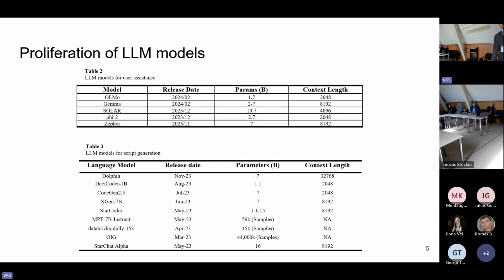Currently, we tested several of them, and LLMs are really a trending topic. Not every year, but almost every month, a new free tool appears, and the functionality really varies. We expect this trend will continue, and we are testing more tools to find the best fitting solution for our product.